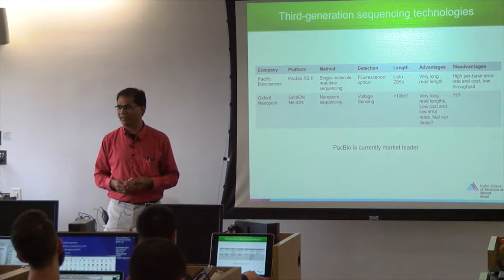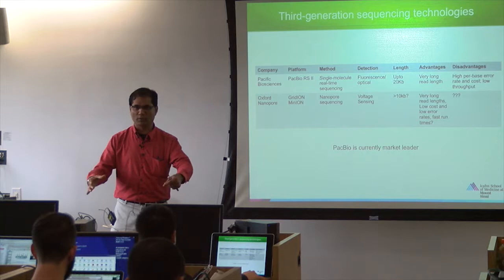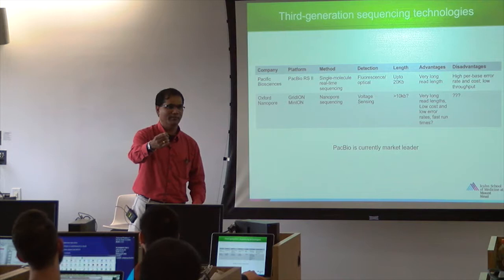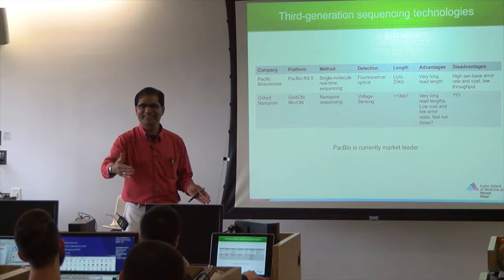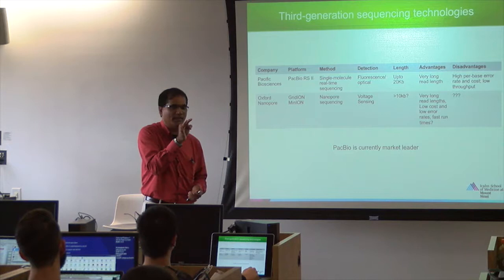Again, big ideas are great. Execution is also important. How do you execute that? How do you do that actually? What you require is a robot inside. You automatically do the reaction, add everything immediately. You start, turn on the camera, do the shooting of the reaction. It should be pitch dark inside, right? And the camera should be much better than a Hollywood camera, right? And then start shooting it, in those tiny wells.